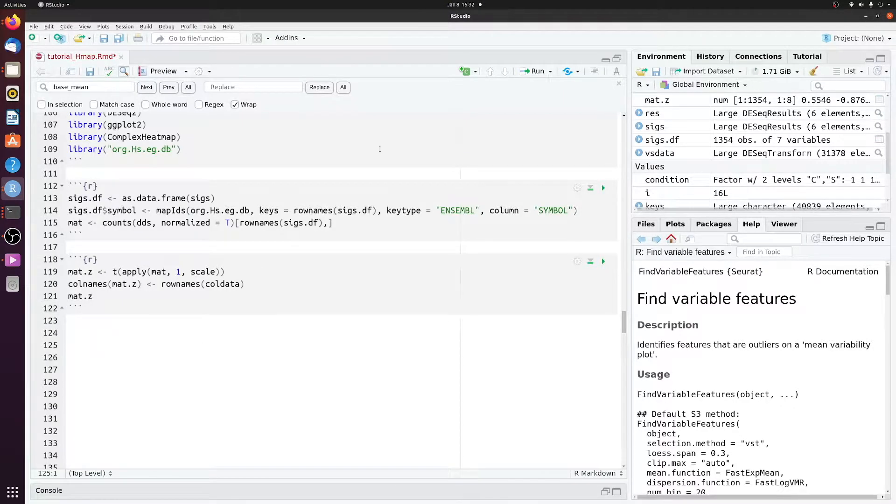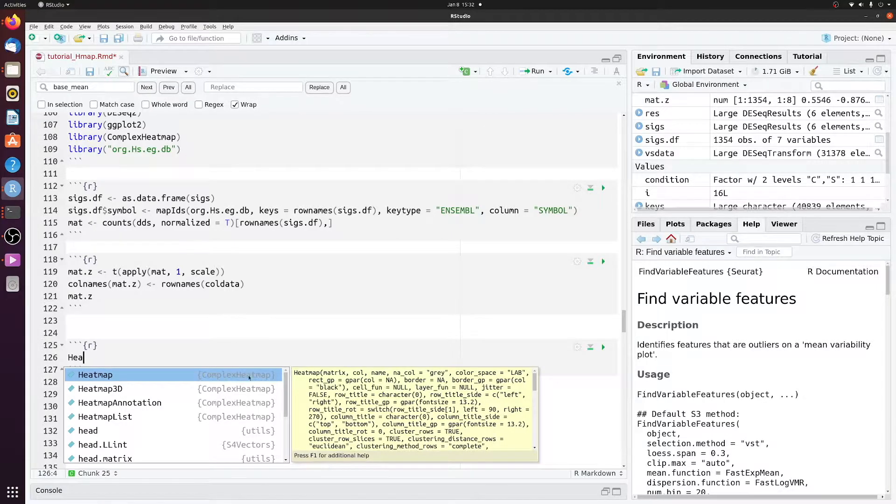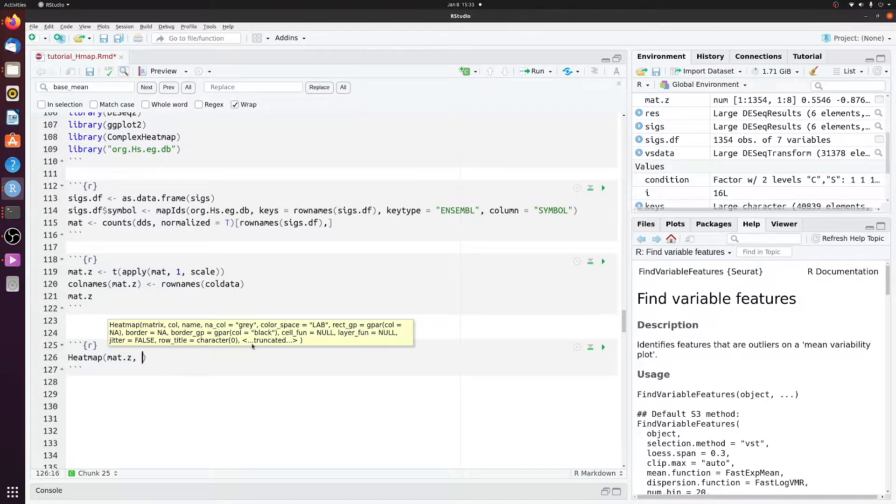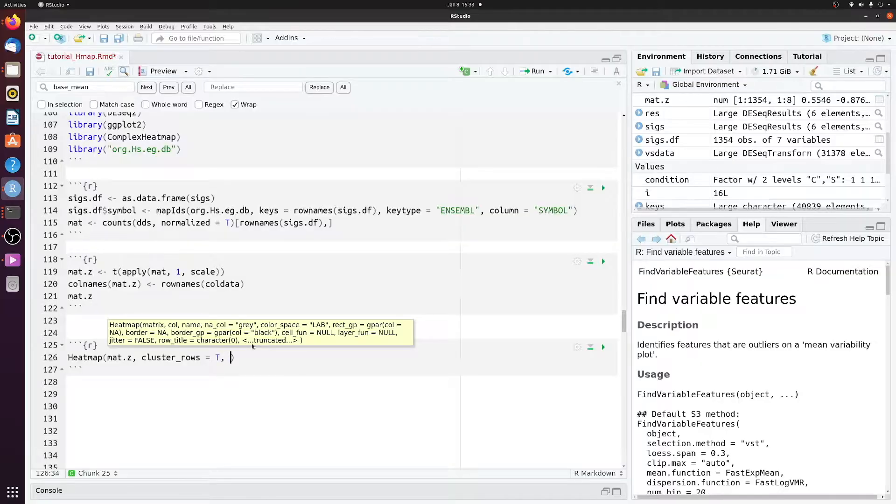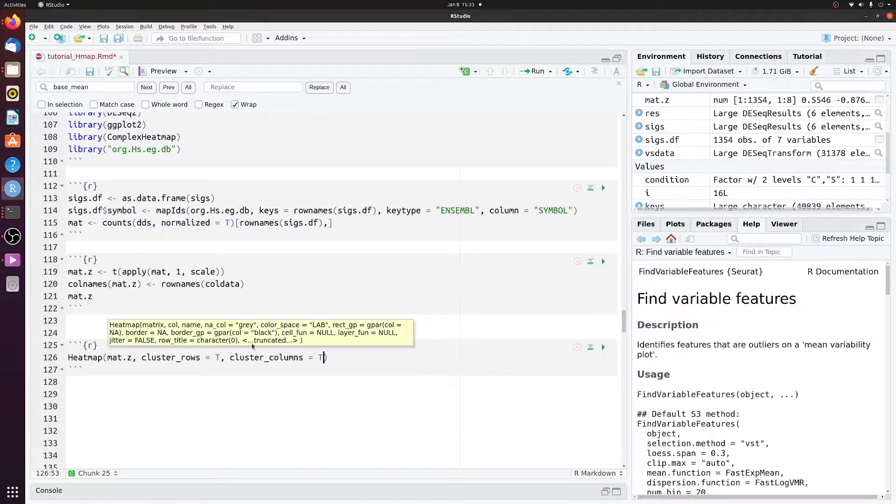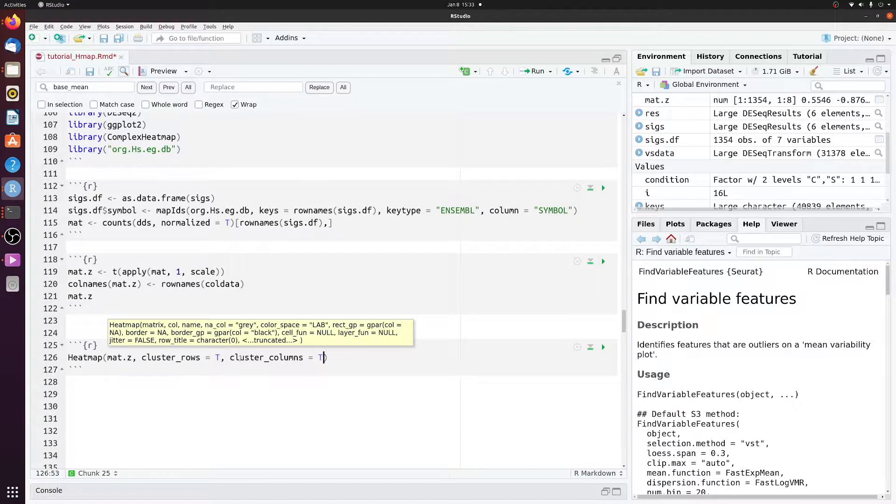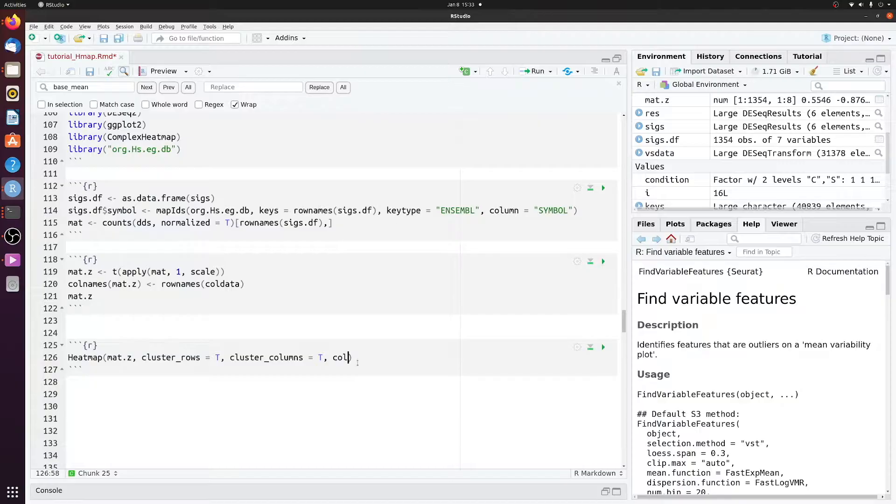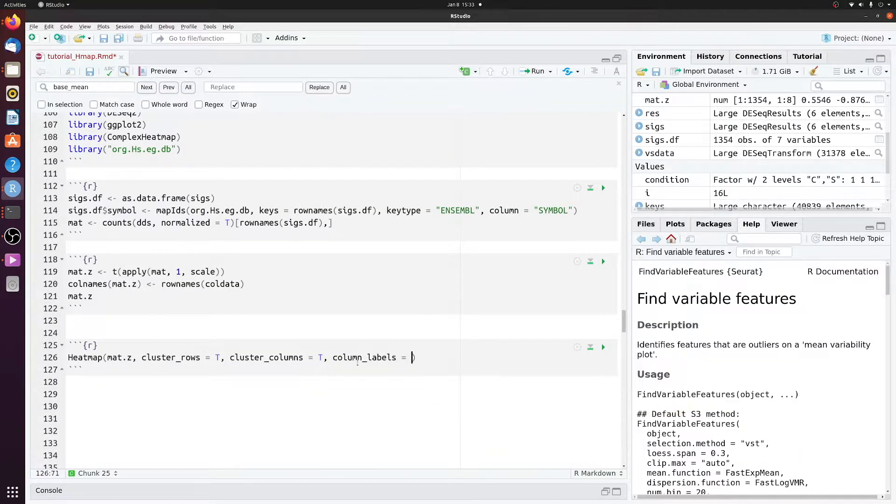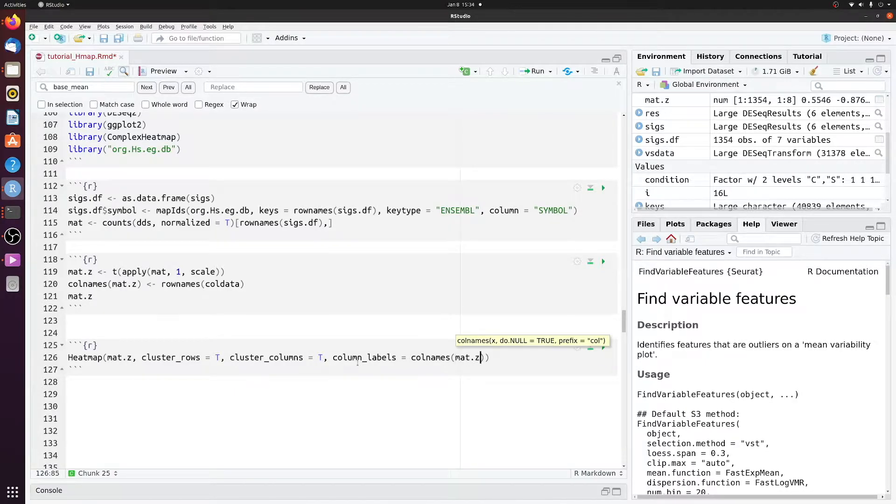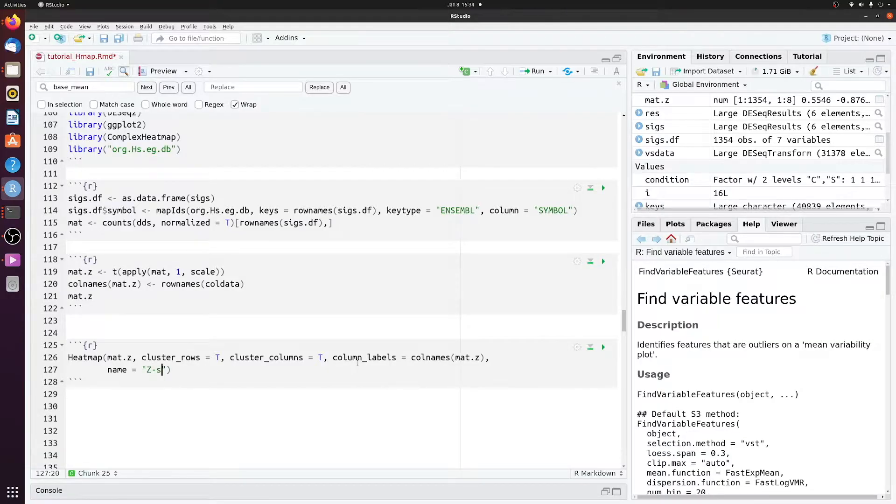And now we can actually make the heat map. So we're going to use the heat map function from complex heat map. And we're going to pass the mat.z object. And then let's just, for now, cluster both the rows and the columns. So we're going to cluster the genes and the samples. You usually always want to cluster the samples. You don't always need to cluster the genes, but sometimes it makes it look a little nicer because it groups similar patterns together. And then column labels is going to equal the call names of our mat.z. And then our name, so our values, we're going to call them zscore. And then that's it.